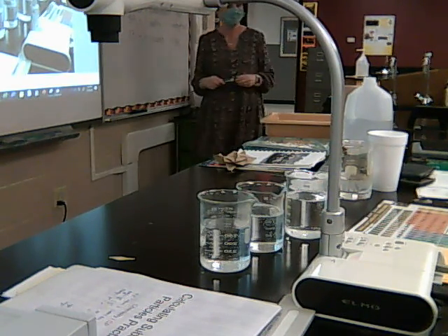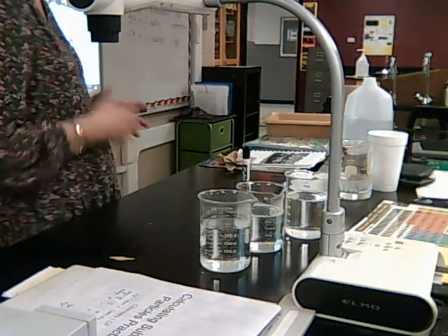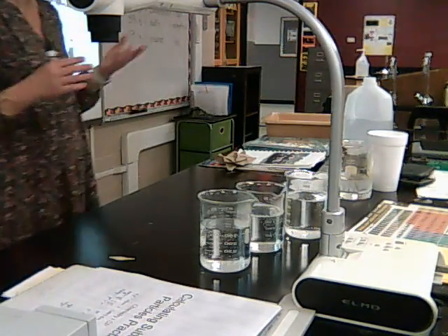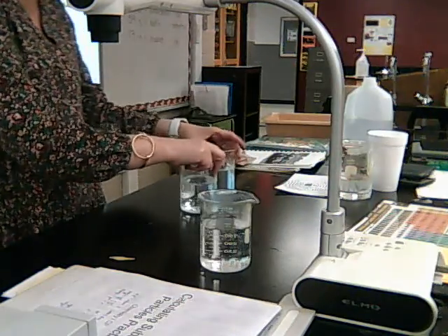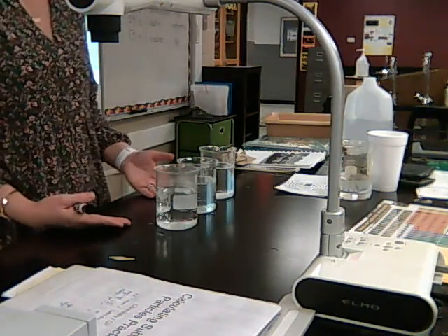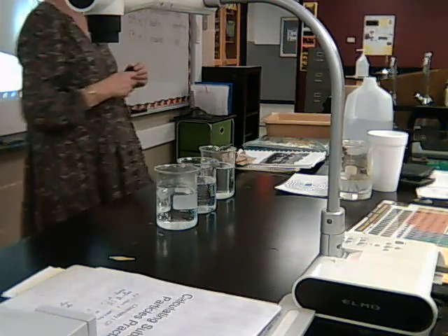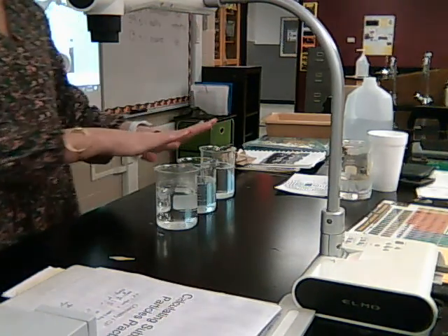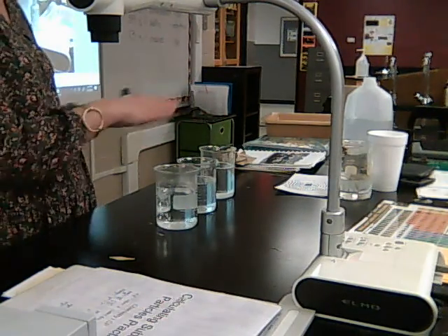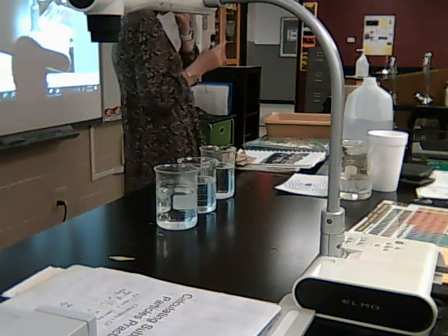Okay? So what was another mistake that I made? If I need to leave everything else the same, what were some things that I kept the same for every beaker? Obviously, temperature was not one, but it should have been. Okay, what about the water? The same amount of water. So that would be a what kind of variable? If I kept it the same and used the same amount in every one. What kind of variable is that? Or constant. I think on your assignment that you're completing, it's the constant variable, okay?